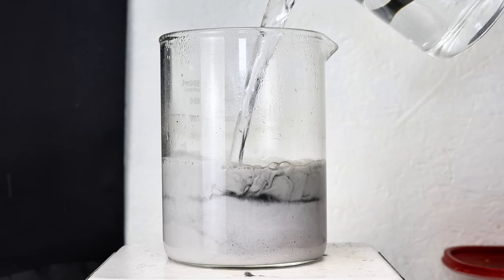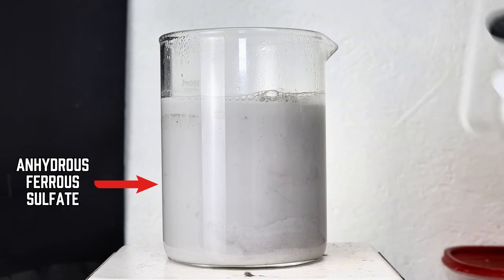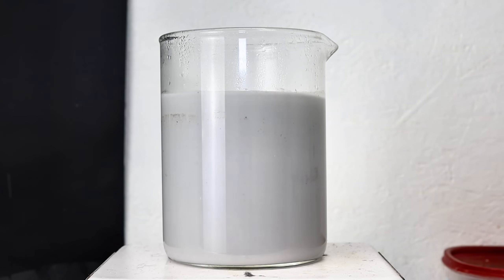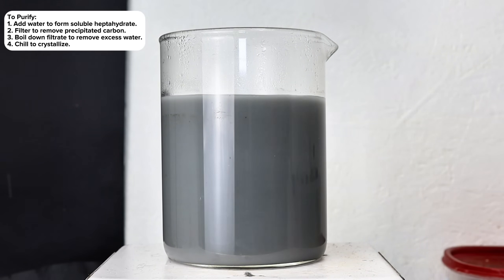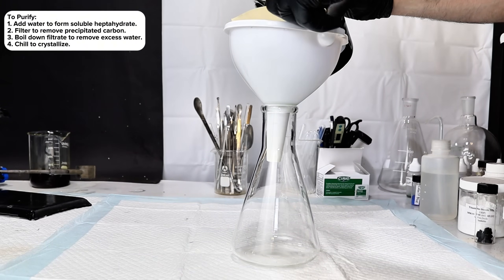The white salt here is anhydrous iron sulfate, and this formed instead of the more recognizable light green heptahydrate because I added water to acid, which again I wouldn't normally recommend doing. To clean this up, I simply added a large excess of water to form the soluble green heptahydrate.